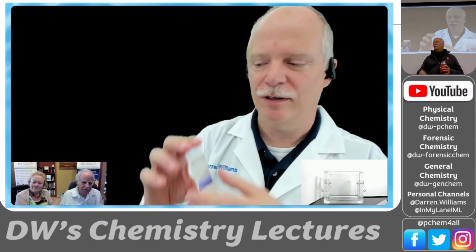I'm going to derivatize them. I'm going to make them less polar so they move faster. They'll still separate from the others, but they're not going to sit on that column forever. This blue compound is going to sit there forever. And so it took this much solvent to move it 10% of the distance. So I would need 10 times more solvent to push it out the end.